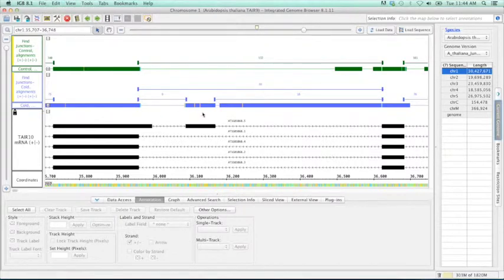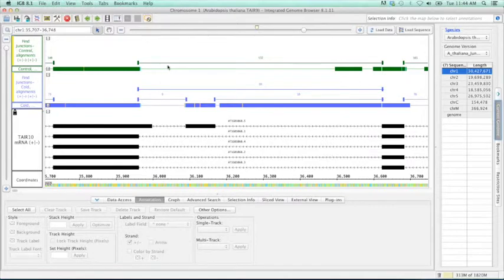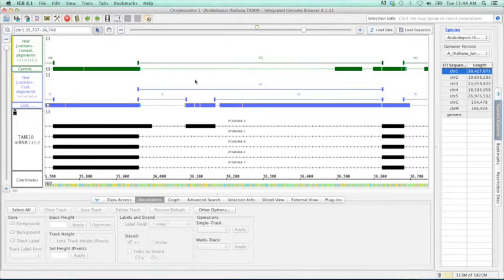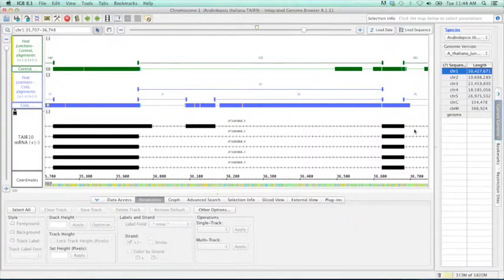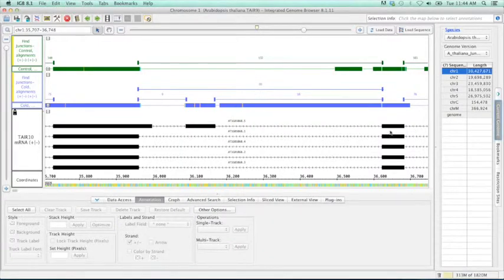These are numeric labels that indicate the number of gapped reads which actually support that junction. So if there's a read on either side, and I believe the way this is designed is that there has to be five bases on either side in order for that to be written to. So it's reads that had to be broken in order to align them? Yes.